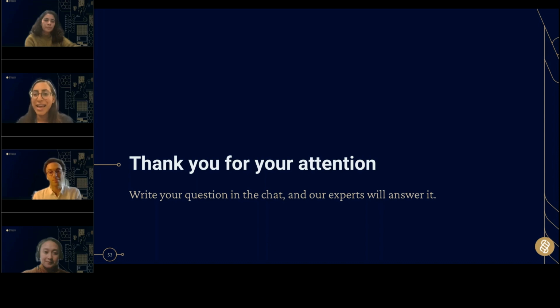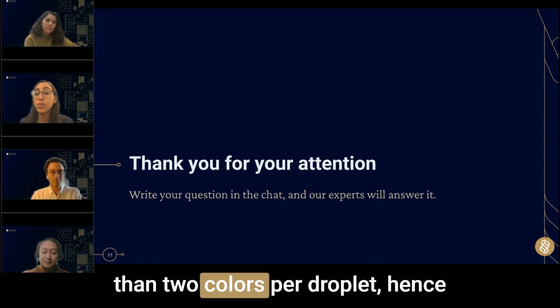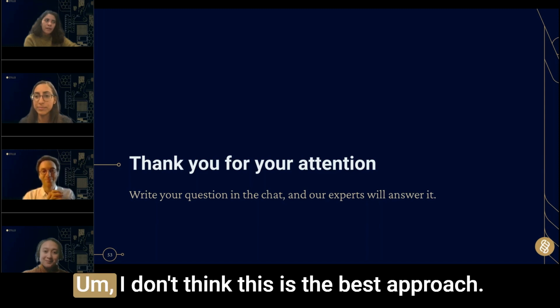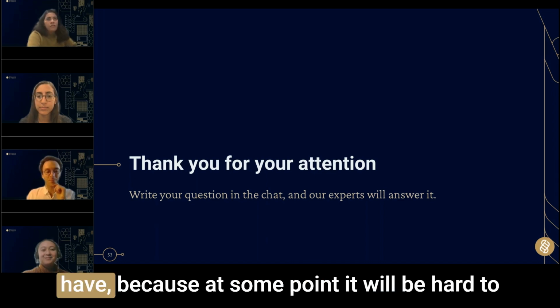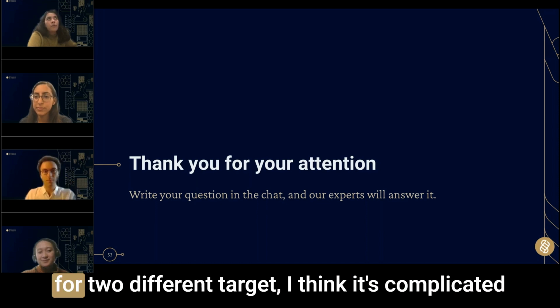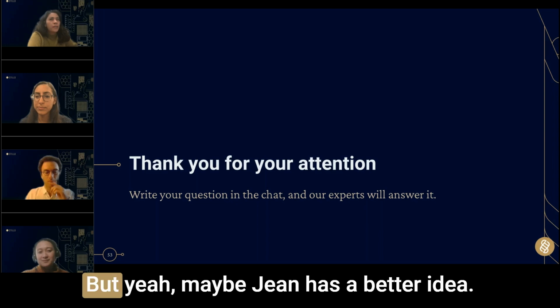Thank you, Jean. There's another question about color combination. Is it possible to measure more than 2 colors per droplet, hence increasing the multiplexing possibilities? I don't think this is the best approach. I think it will depend on how many targets you have, because at some point it will be hard to distinguish between, like, if you have three colors and one color which is the same for two different targets, I think it's complicated to discriminate which target it's coming from. But yeah, maybe Jean has a better idea.